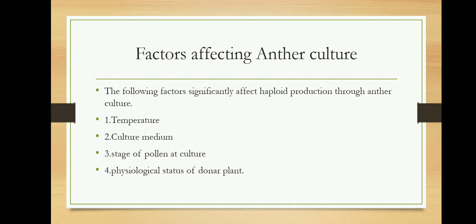And when the Nicotiana tabacum anthers were kept at high temperature, only 21% of anthers yielded embryos for the same period, that is 72 hours.